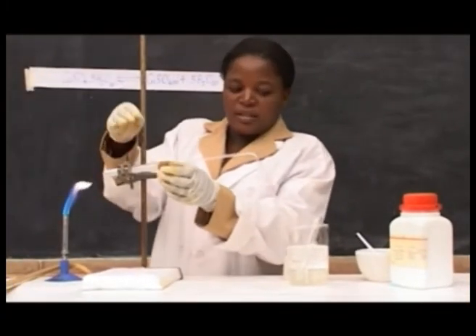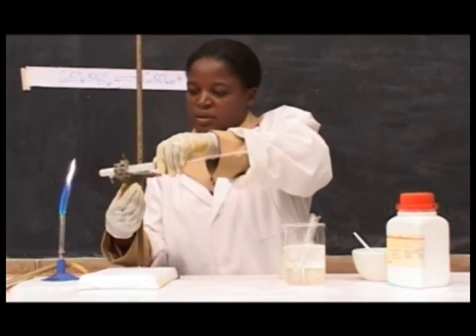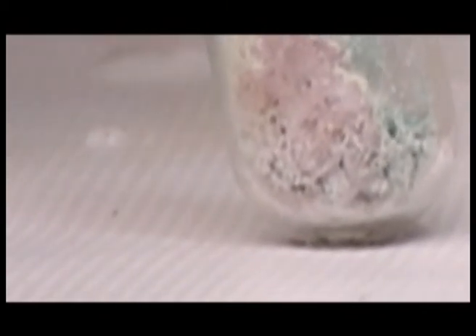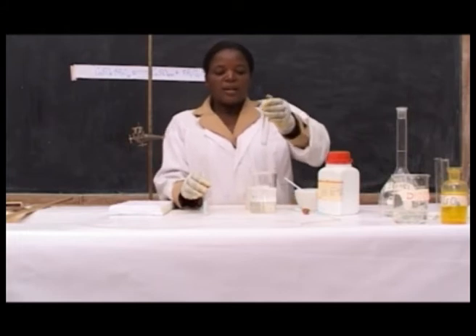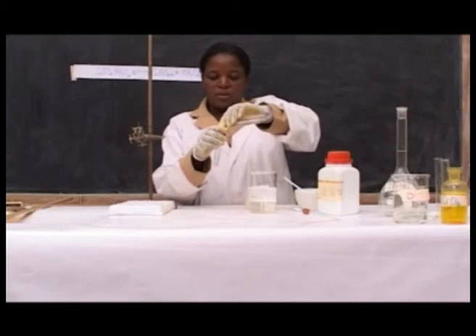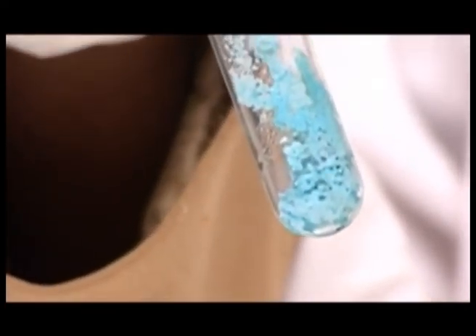Then take the residue. The residue remaining is white. Take the test tube which contains water which was collected from the salt, then add it to this test tube. Observe the changes. The blue color has been regained.